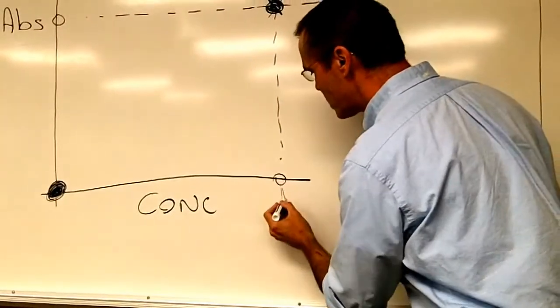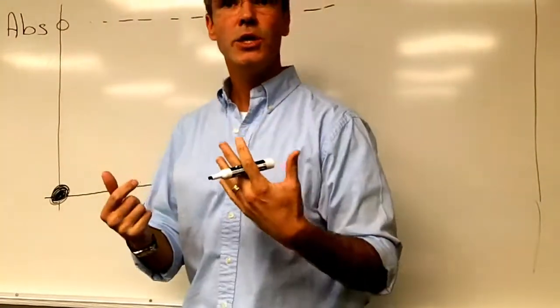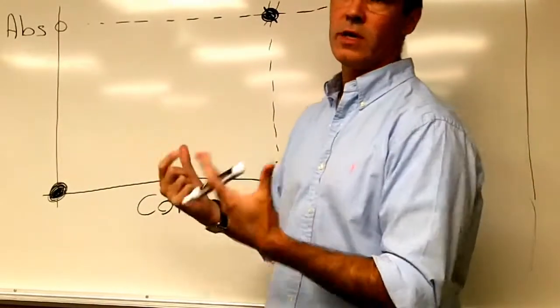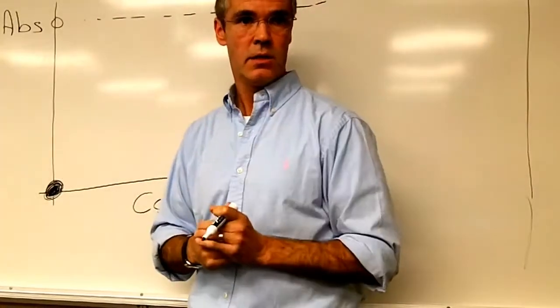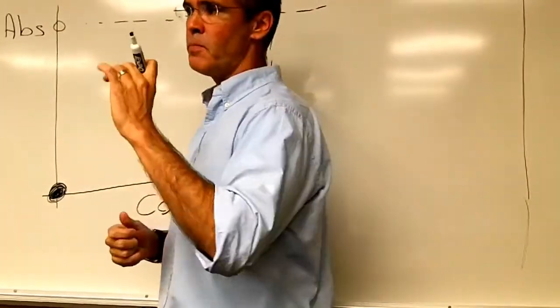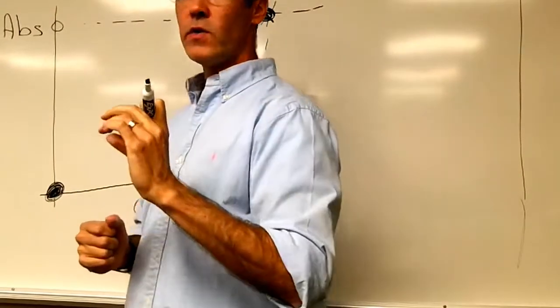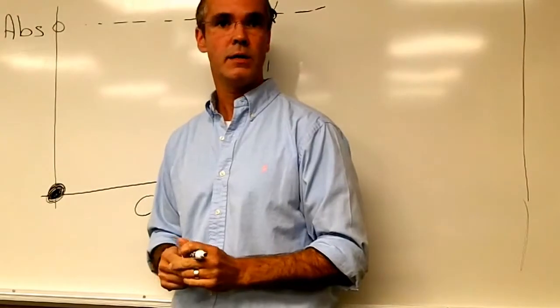And that concentration here depends on what you want to do. And experience will eventually tell you, oh, I should do this, I should do this, right? Yesterday, we had a very concentrated green solution. And yesterday and the day before, we had a pretty much diluted solution of an unknown, right? We didn't know how much there was in there, right?